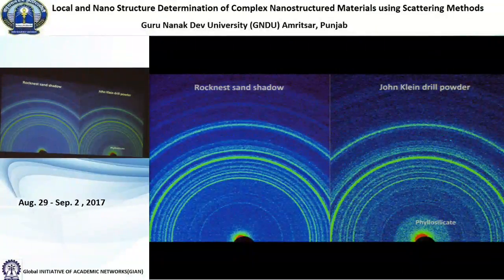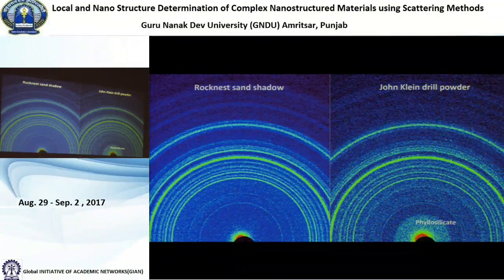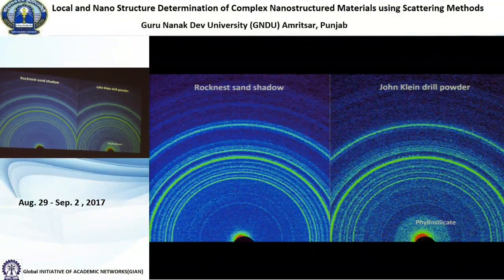But because the powder is isotropically scattering, it's scattering in all directions, it's very inefficient to have all of this intensity here, but just take a cut. So the first step that we do is we have software that will do an azimuthal integration.